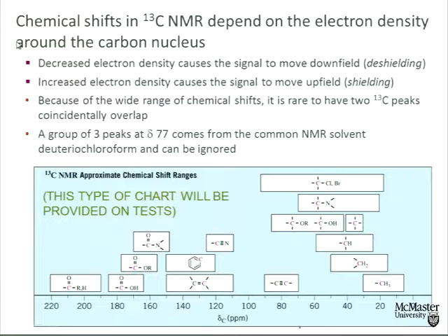And so we're learning more and more about what's going on. Methyl groups, as I mentioned, on the far right. So this table of chemical shift you can take to the bank, you can use it in the test. If there's a signal, for example, at say 70 ppm, then you can be fairly confident that that is not a carbon with no heteroatom attached. 70 ppm, you've got an oxygen or a nitrogen or a chlorine attached, right? Electronegative elements on an sp3 hybridized carbon push the chemical shift to larger numbers.